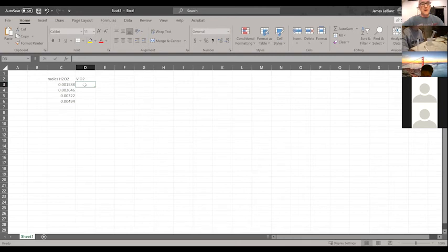When we go PV equals nRT, we don't use milliliters. We use liters. We use atmospheres, Kelvin, moles, and liters. So we've got to convert my milliliters to liters. So my 15.5 mils magically becomes 0.0155 liters.